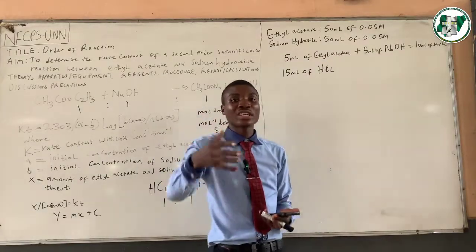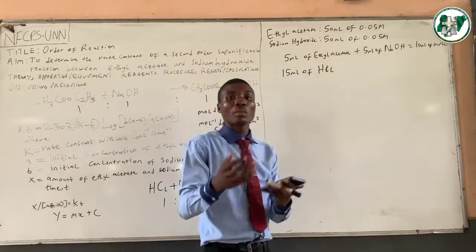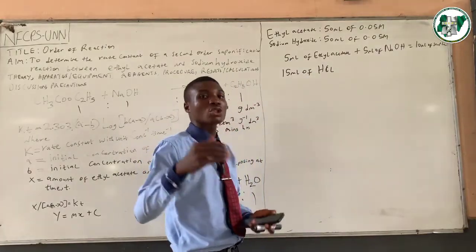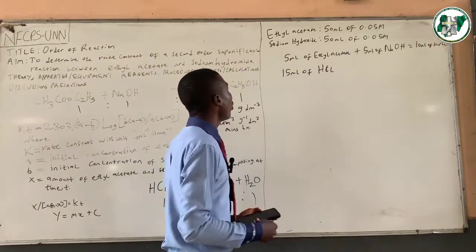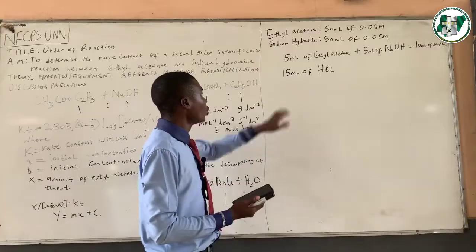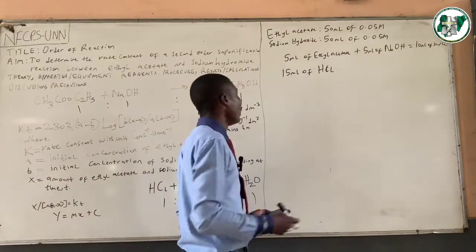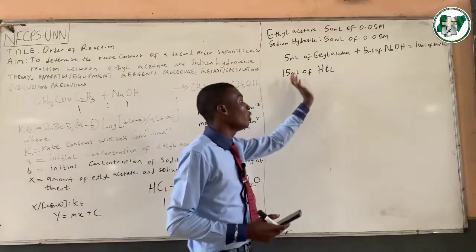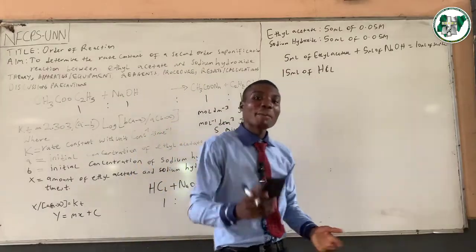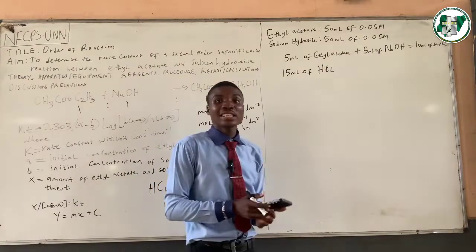You're also going to be titrating with sodium hydroxide, of the same concentration, with this particular acid and your methyl orange indicator. So take note of the color change for the methyl orange indicator. When you do your titration, you will need to neutralize this acid to get to the end point of methyl orange. If you have 15 ml of HCl left, how many ml of sodium hydroxide are you going to need to neutralize the HCl?